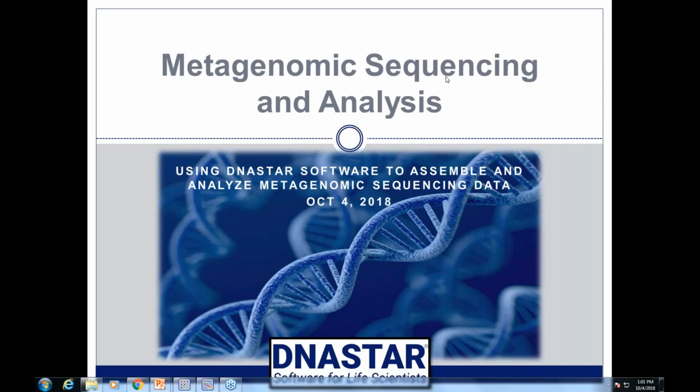Today's webinar will cover some metagenomic workflows in DNASTAR software.